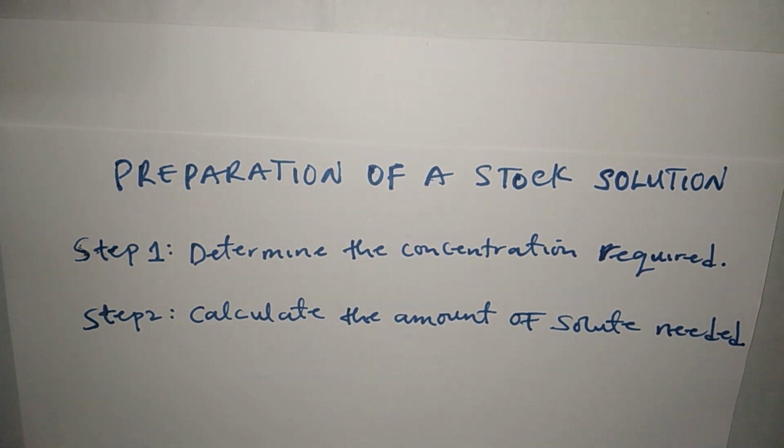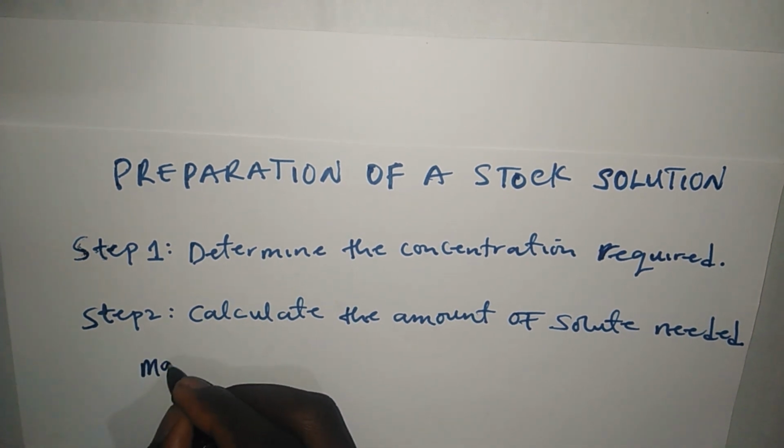Step 1. To prepare a stock solution, you need to know the concentration required for your experiment. This information can be found in your lab manual or in the experimental protocol. Step 2. Calculate the amount of solute needed. You calculate the amount of solute needed in mass.